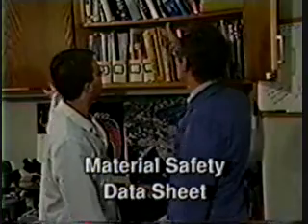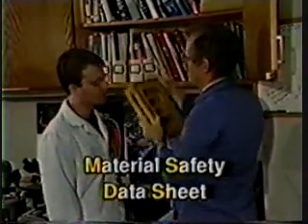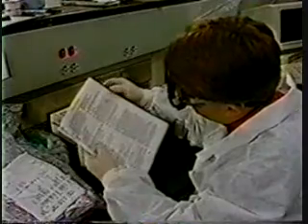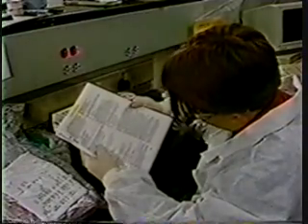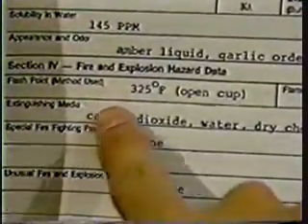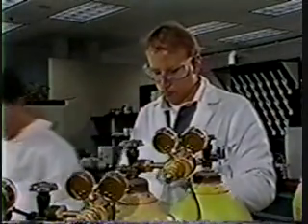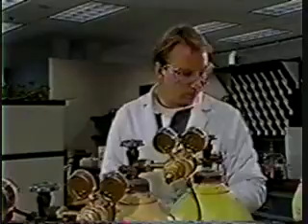As you know, the Material Safety Data Sheet, or MSDS, provides more detailed information about the chemical than the container label. Your lab maintains an MSDS for every chemical in your facility. Remember to read the MSDS before you work with an unfamiliar chemical. This will help you prevent problems. Review MSDSs from time to time while you work as well, to make sure you're using the chemical safely.